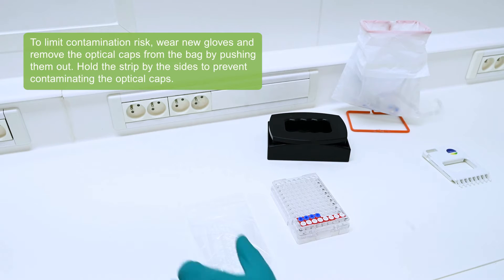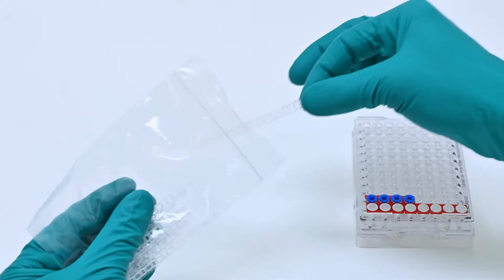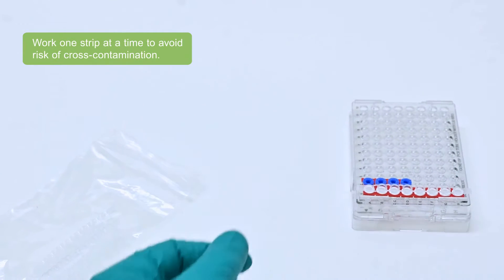To limit contamination risk, wear new gloves and remove the optical caps from the bag by pushing them out. Hold the strip by the side to prevent contaminating the optical caps. Work one strip at a time to avoid risk of cross-contamination.